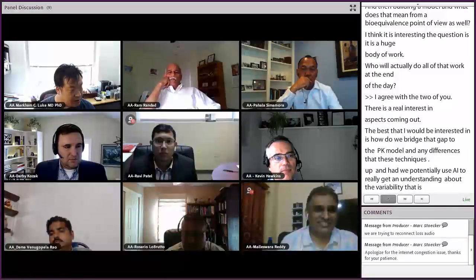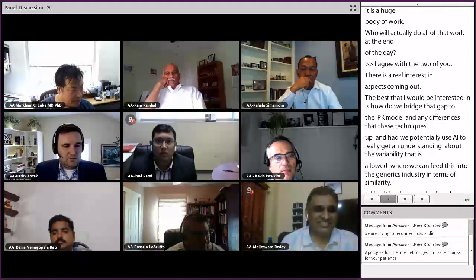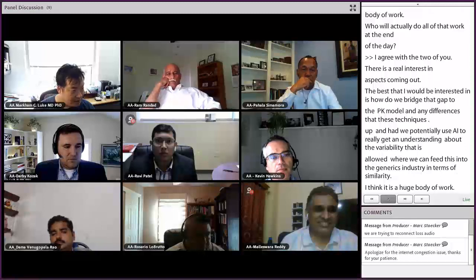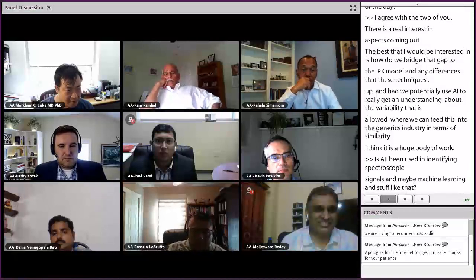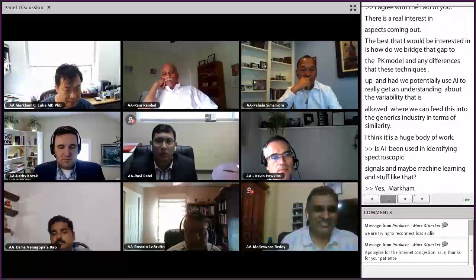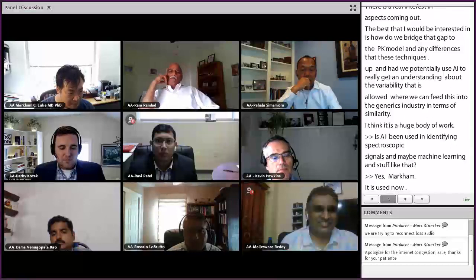Is AI being used at identifying spectroscopic signals and things like that? Maybe machine learning as far as curve signatures and stuff like that? Yes, Markham. This is Malleshwar. AI is widely used now. We are already experimenting using AI for image analysis, for spectroscopic analysis, even for chromatography peak assignments and chromatographic method development. So various areas the AI is coming up now.